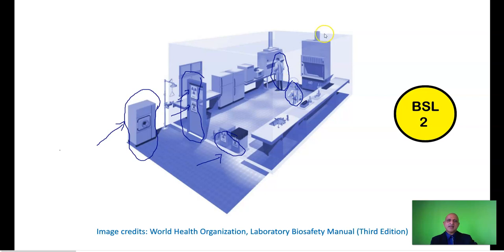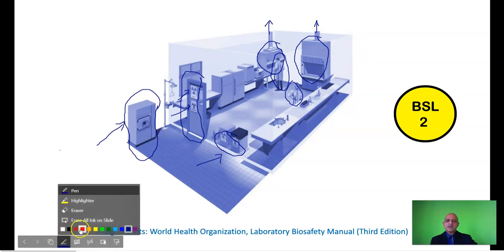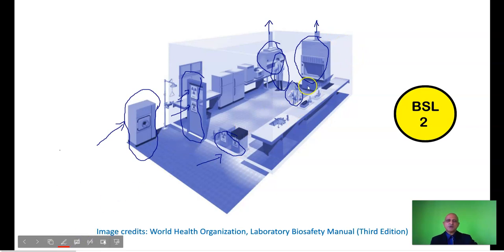Okay. Now, at the end of this lab is the fume hood. And this is the biological safety cabinet. You will note that these are ducted into the ceiling, and they are hard ducted, and they release their fumes into the external environment. What I want to highlight here is the location of these.